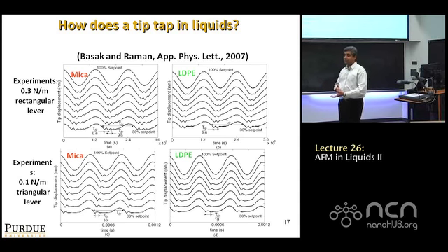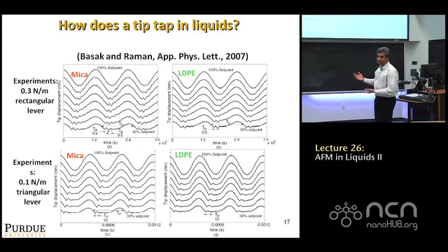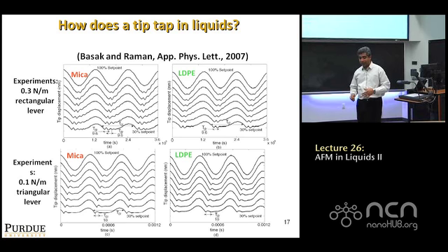So in this case, the one that rings the most is the second eigenmode. The third, fourth eigenmodes are very stiff. They don't really ring much, okay? So the main one that you observe is the second eigenmode that rings a little. The key thing is that the amount of ringing seems to depend on the stiffness of the sample. Not surprisingly, you try tapping a glass with a hard object, you get more ringing. You try to tap with a soft object, you get less ringing, right? So that's the whole idea.